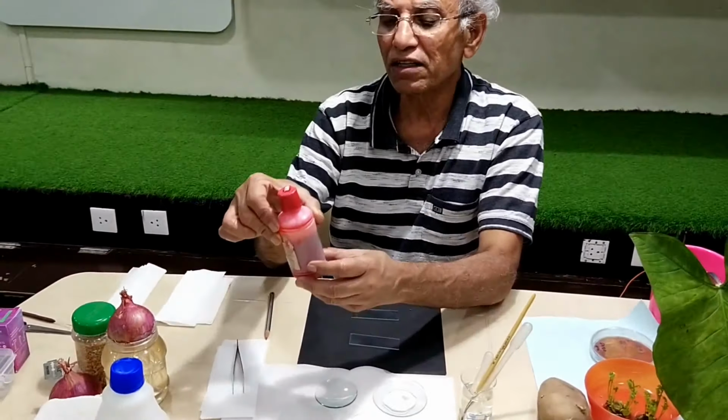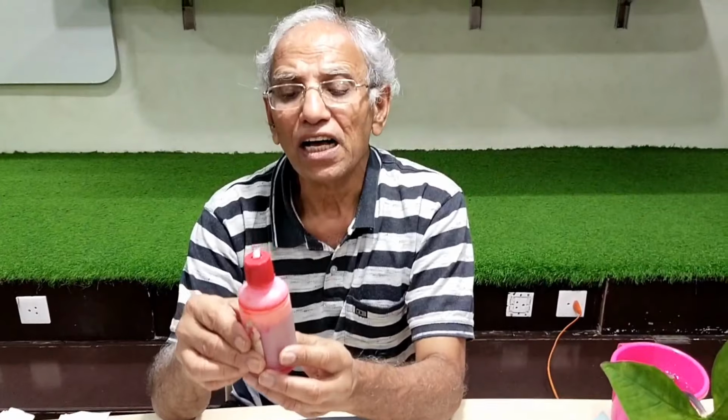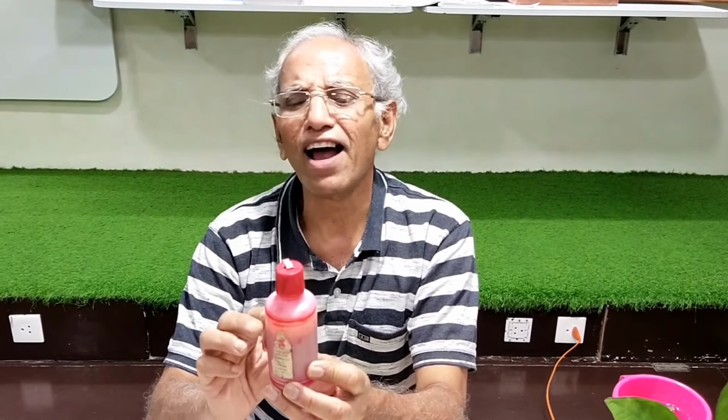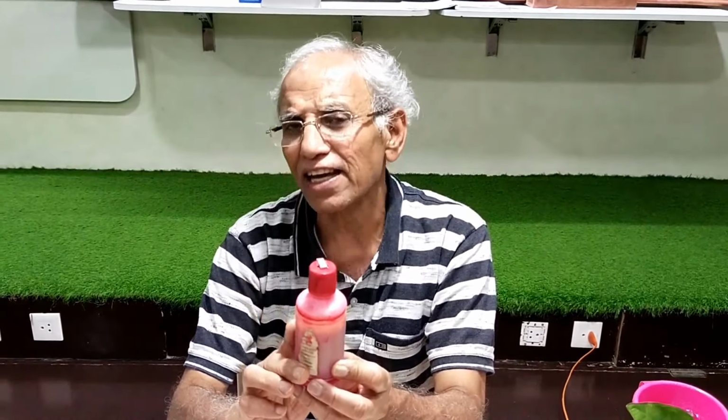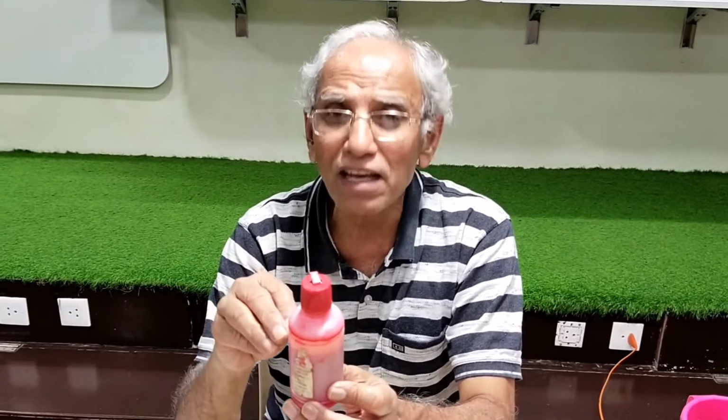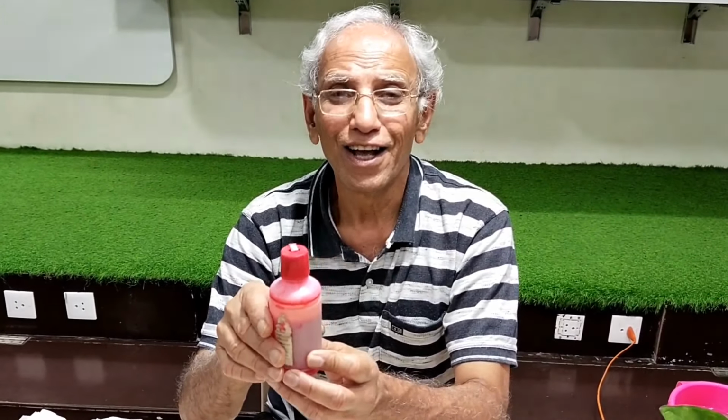Here is a stain, and this stain is eosin stain. What is the name of the stain? Eosin. And eosin is an acidic stain, which means it will stain the basic things in the cell. There are two types of stains, acidic and basic. I'll tell you one example of a basic stain, hematoxylin. Or acetocarmine, it's a basic stain. So a basic stain will stain acidic things.